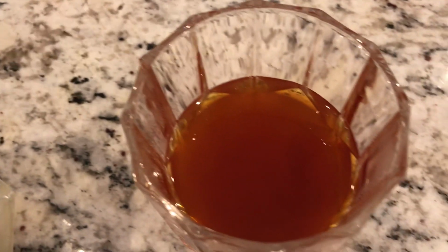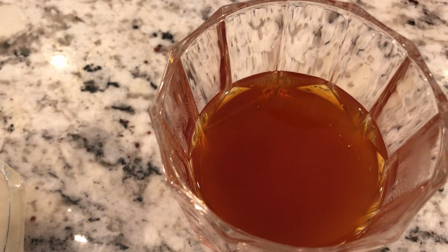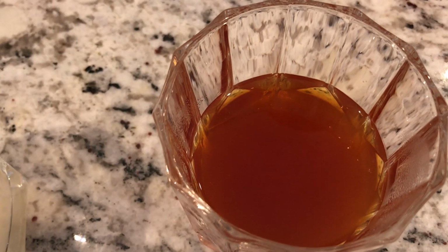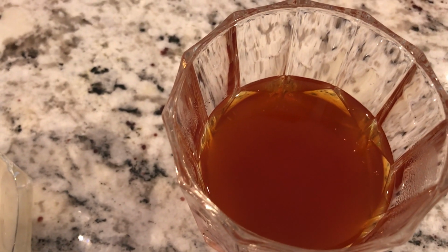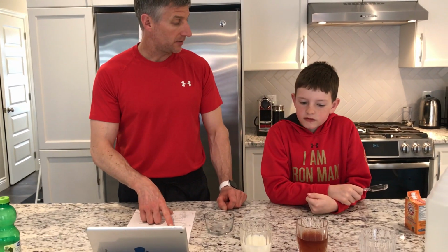And we're going to take a look at evidence of a chemical change. I believe there is a change of color there. A change of color, and is that on our list of things to look for? Yes. Change of color. So we're fairly confident that we have a chemical change there, right?